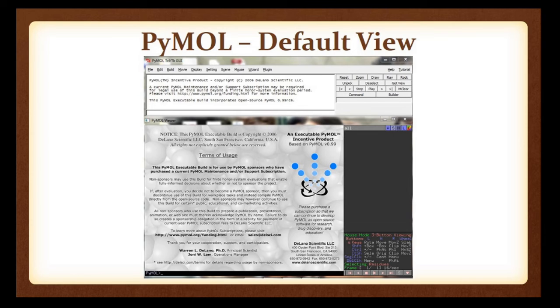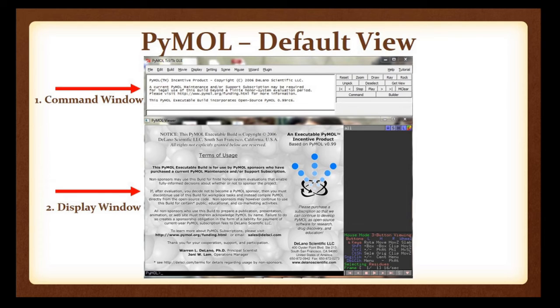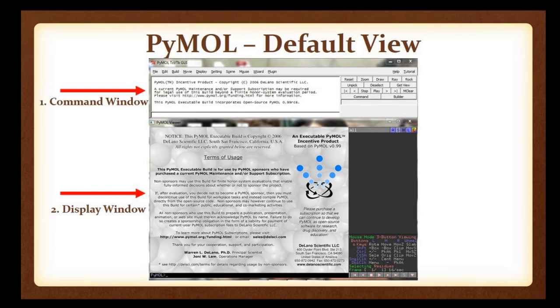This is the default view of PyMOL once you download and install it. When you open PyMOL, there are two important windows: one is the command window, where we import biomolecules, and the second is the display window, where the imported biomolecules are displayed. In the display window, there are five sections on the right side: Actions, Show, Hide, Label, and Color.